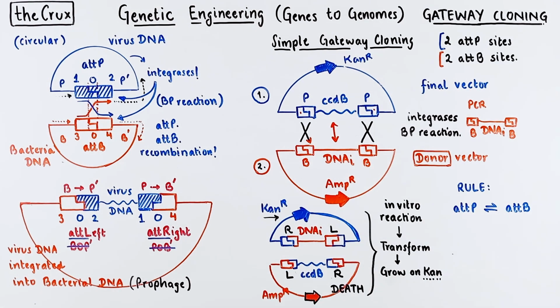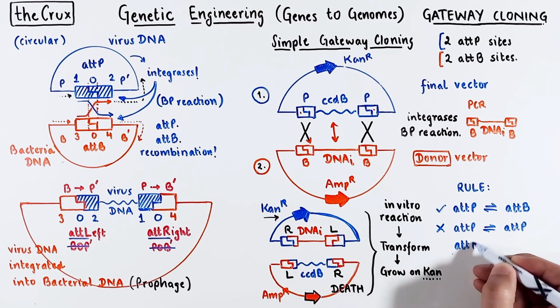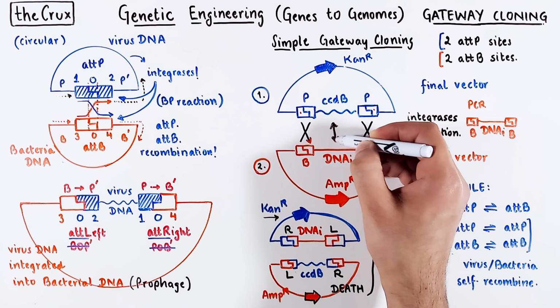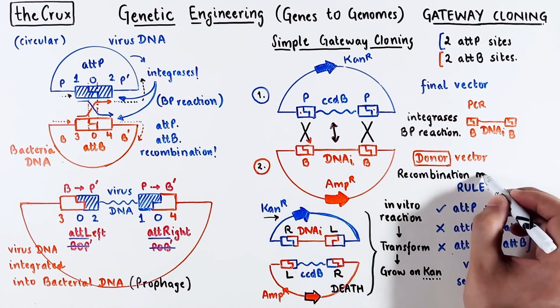attP and attB can recombine, but attP and attP do not recombine. Likewise, attB and another attB cannot recombine. If these two were true, then bacterial and viral DNA during infection process will recombine by themselves, and that will mess up everything.